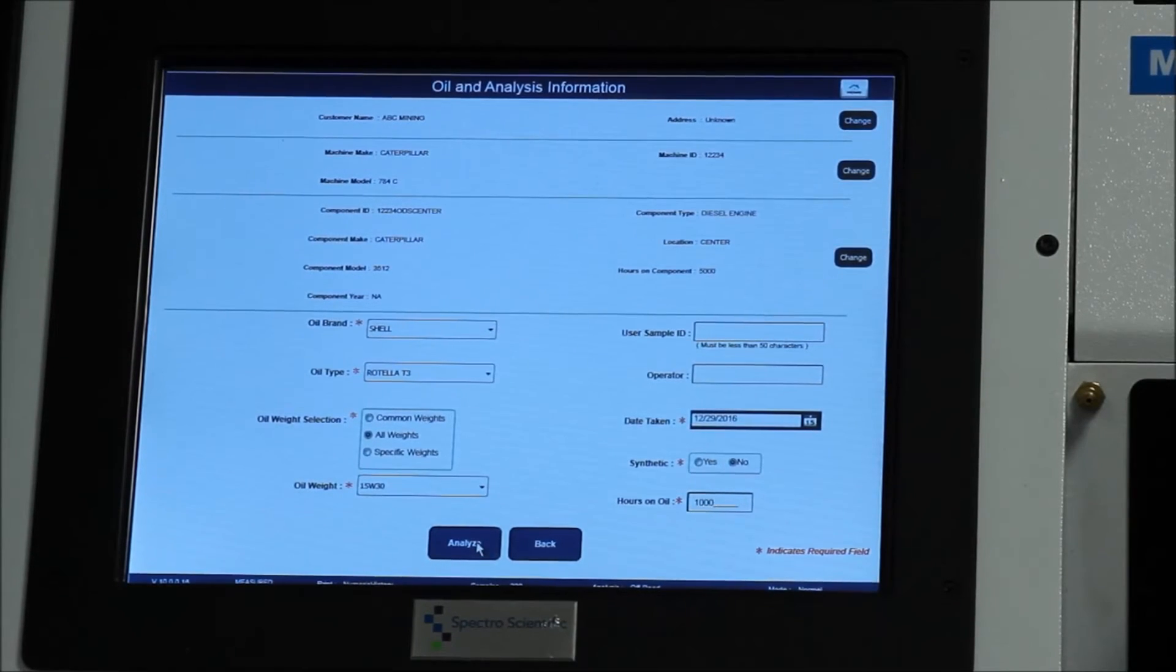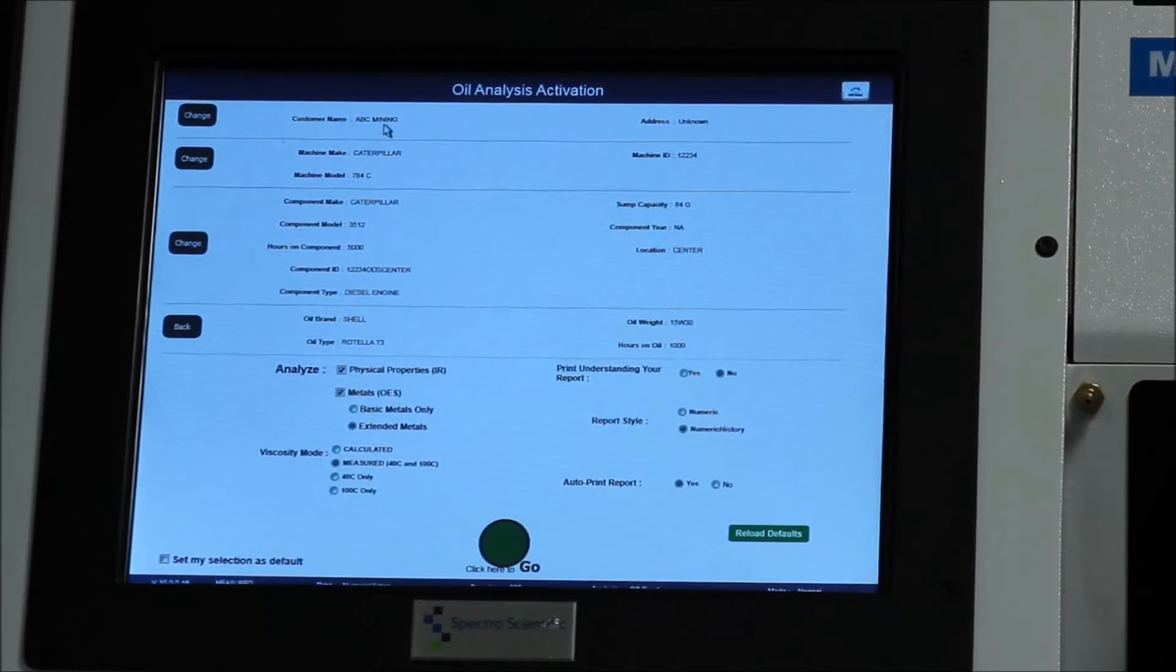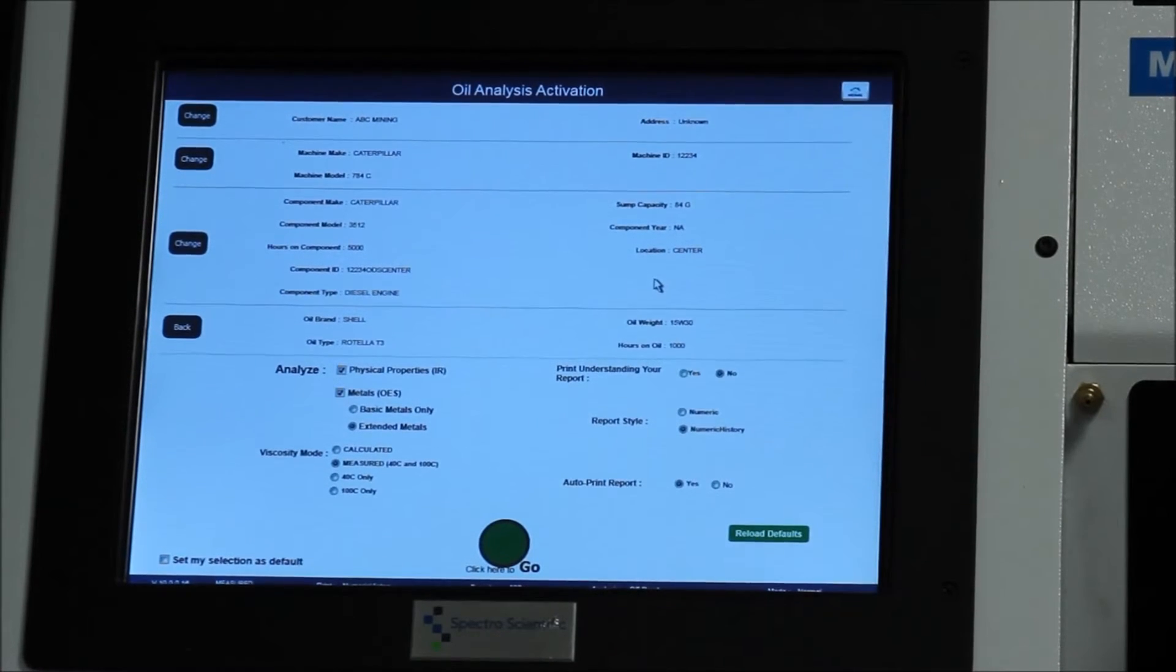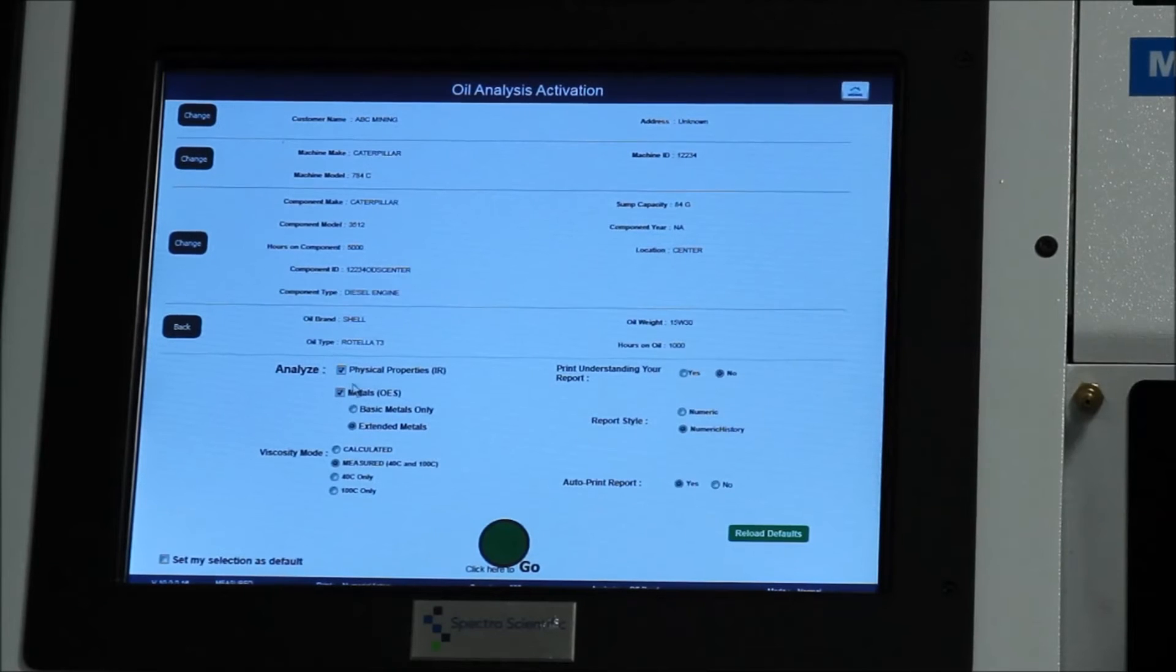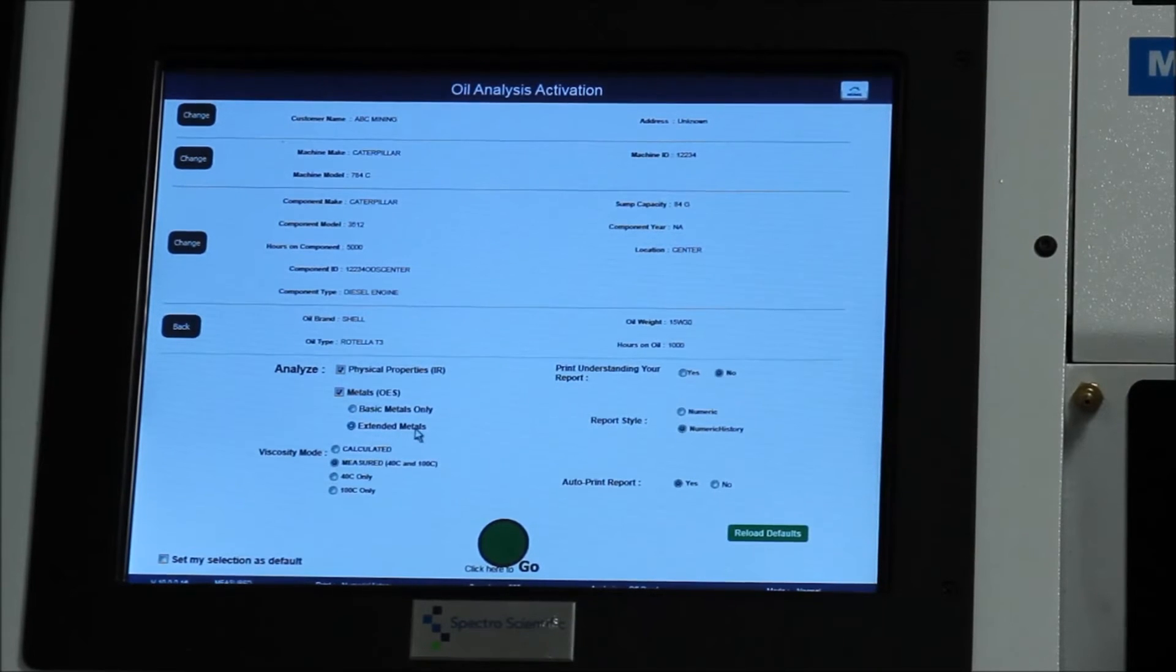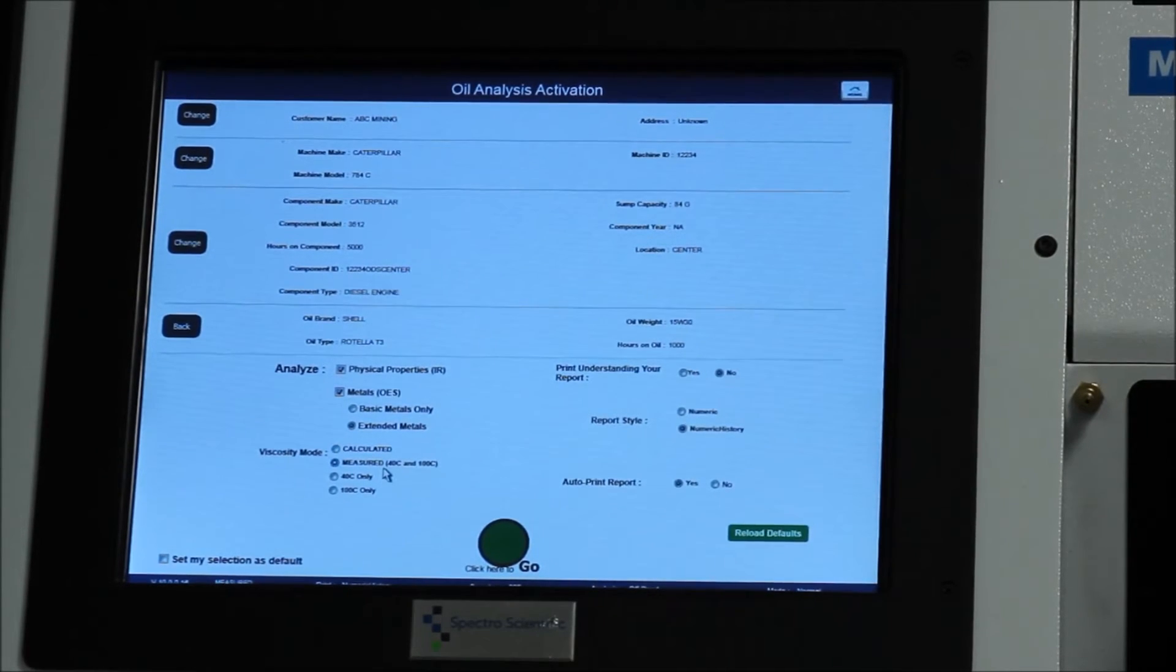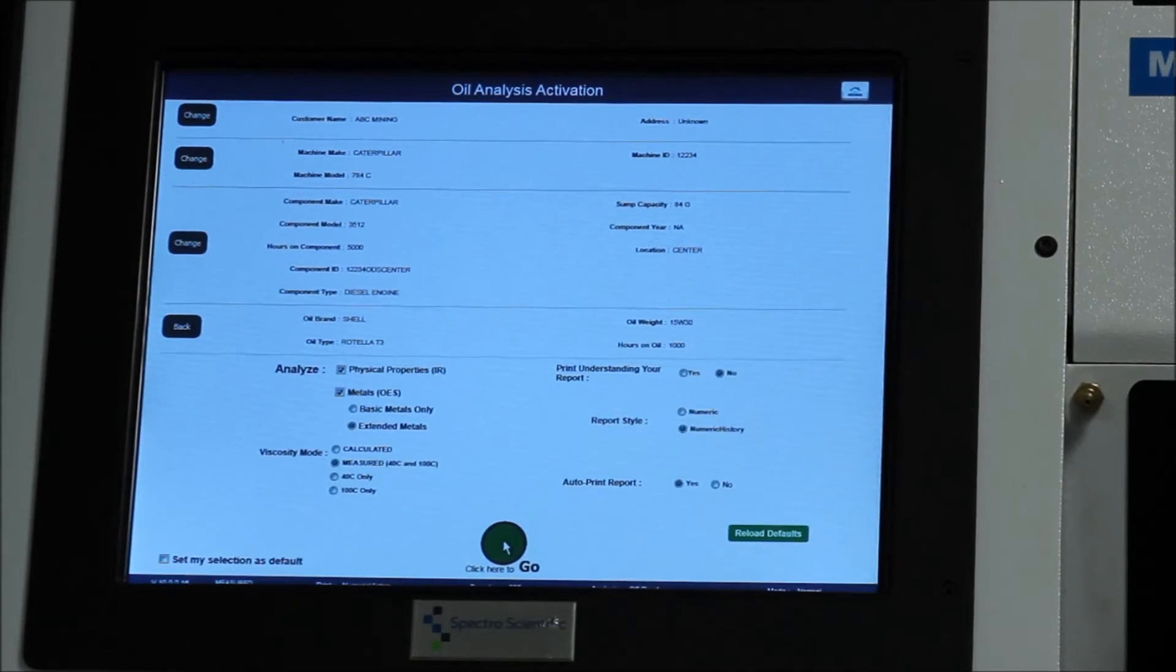Next we're going to click Analyze. So finally we have all the information that we've entered. You can see at the top it has the company, the equipment information, and then the oil information that we entered. If we want to change anything, the left hand side has the change buttons and this would allow us to make edits in any of these sections. Down at the bottom it's showing the test that it's going to run. So here we're going to run the physical properties for the oil chemistry, the metals, giving the full extended metals, the 20 elements. And then the viscosity. And you have a choice of calculated or measured viscosity. Measured it is actually running the viscometer, which gives you the most accurate results. And then we can hit the go button.